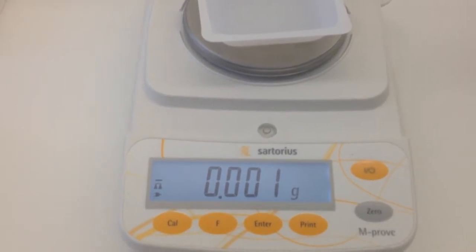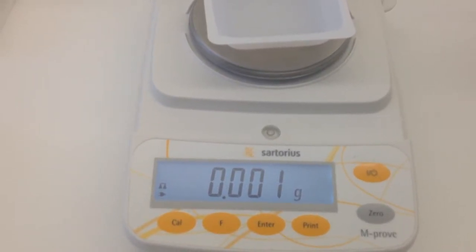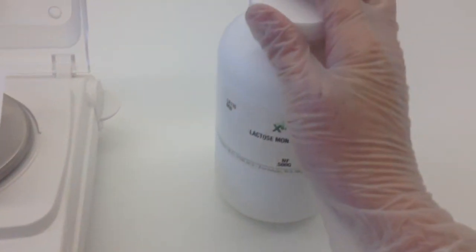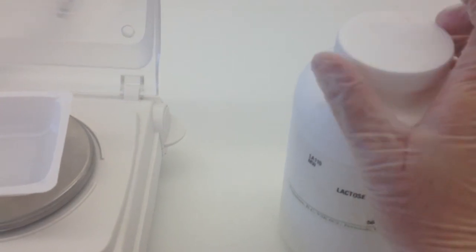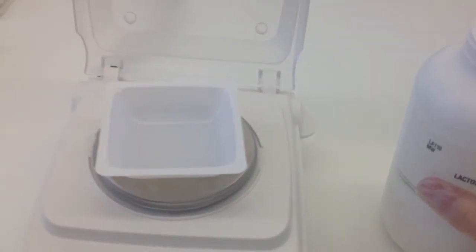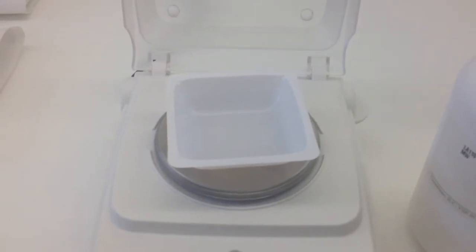That third digit may fluctuate a little bit, but that's okay — nothing to worry about. We can then go ahead and start weighing out our product. So for today's demo we're just going to be using lactose, and we can go ahead and start adding the lactose to our pan using our spatula.